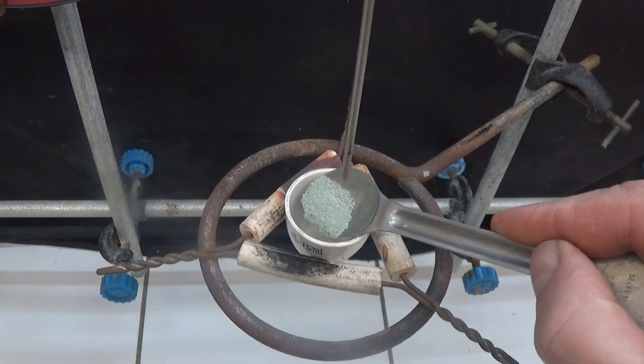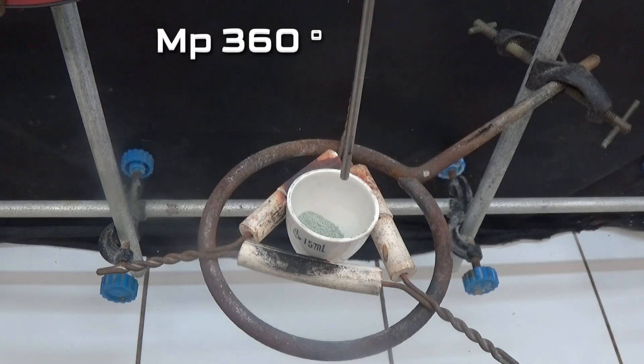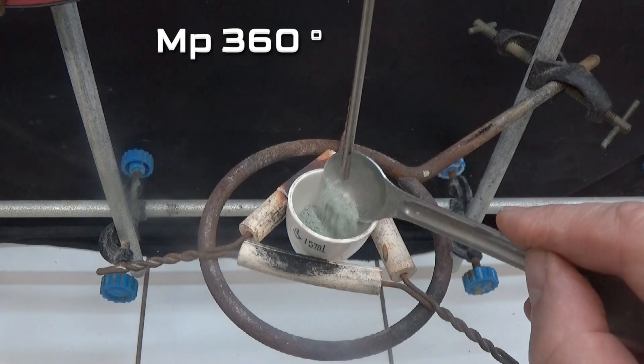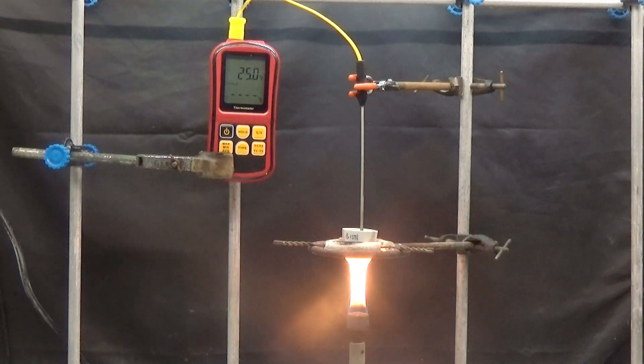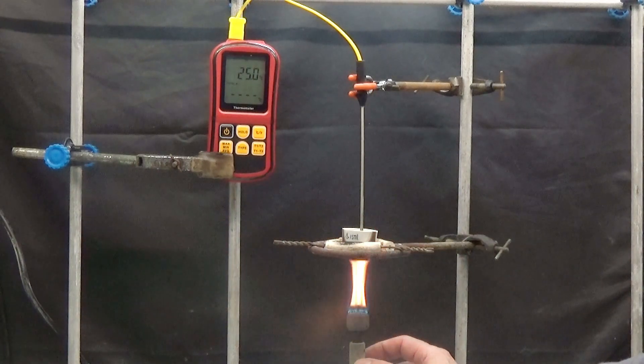The melting point of acridone is 360 degrees. In my laboratory I do not have any method to determine such a high melting point. I have set up a rudimentary apparatus to melt the acridone and with a digital thermometer I measure the temperature.